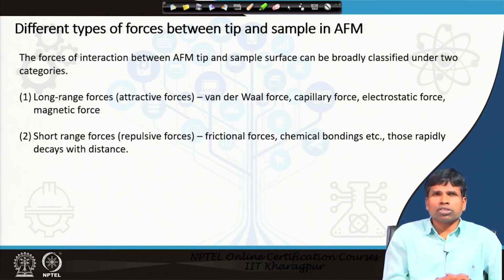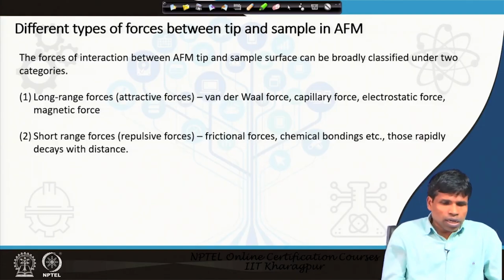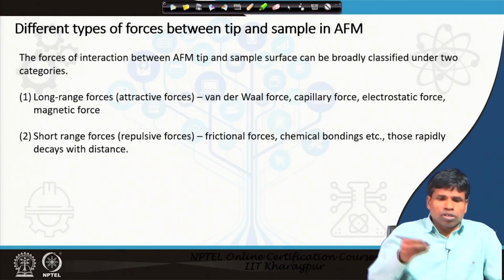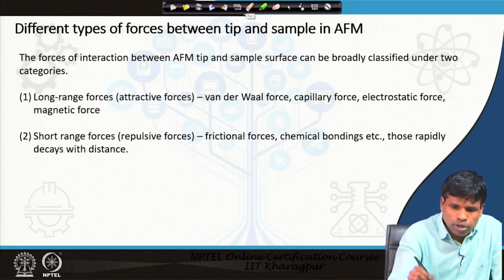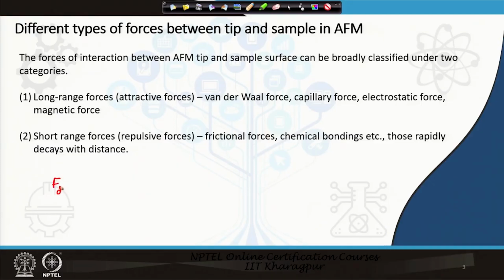Similarly, we have short range forces. Short range forces include frictional force, adhesive force, and also the chemical bonding that exists on the sample surface. As far as the van der Waals force is concerned, we have discussed this: F_VdW is equal to minus HR over D squared.